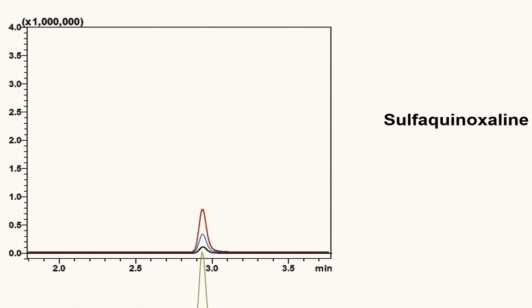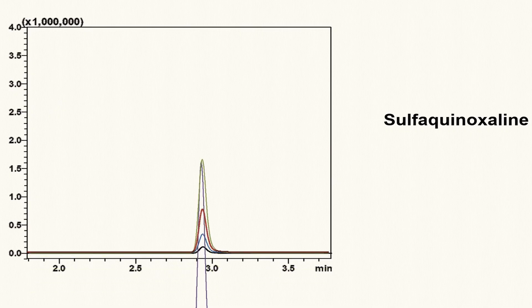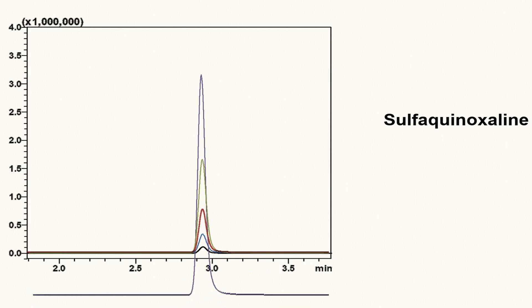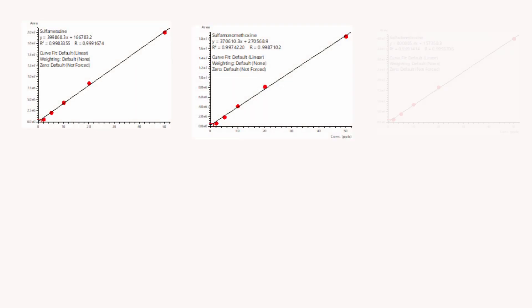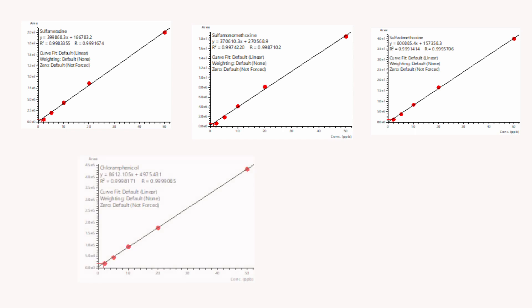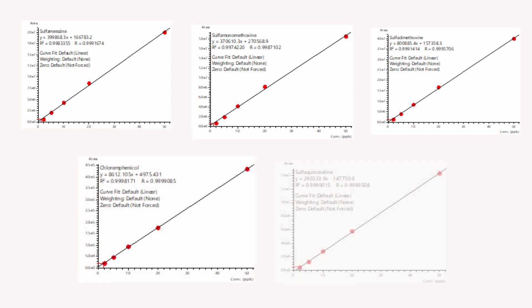Let's look at the overlay of the chromatograms of calibration standards for sulfaquinoxaline. The calibration curves for the five compounds with good linearity were generated by LabSolutions Insight software, with an R-squared value above 0.997 achieved.